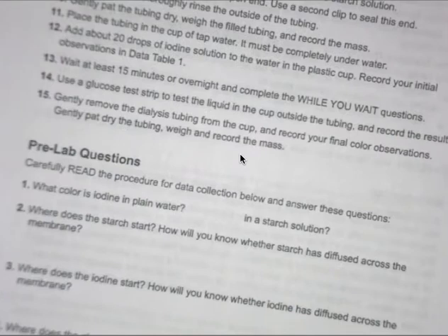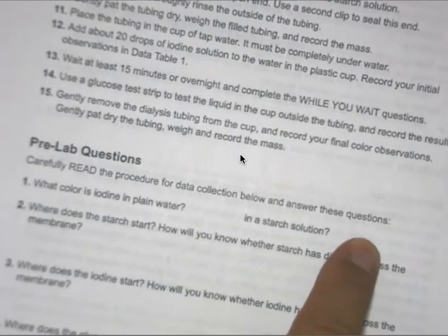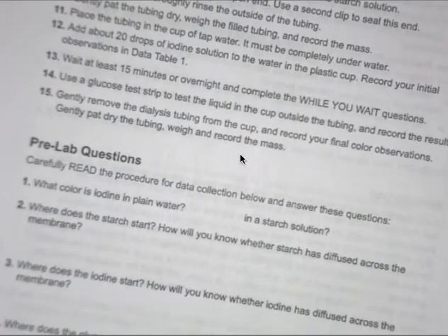So let's take a look now at the pre-lab questions here. Number 1 says, what color is iodine in plain water? What is iodine's color in water? Think back to the carbohydrate lab. What happens when iodine and starch combine? If you don't recall, go back to the carbohydrate identification lab. Watch that video.